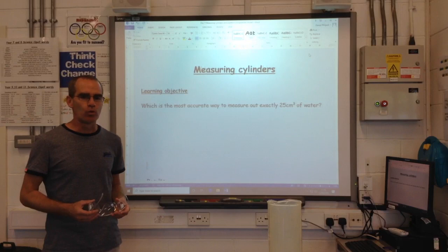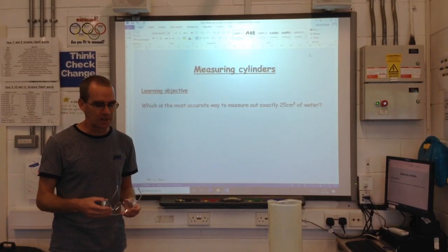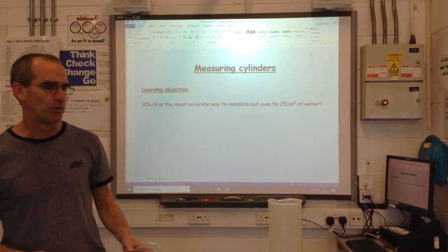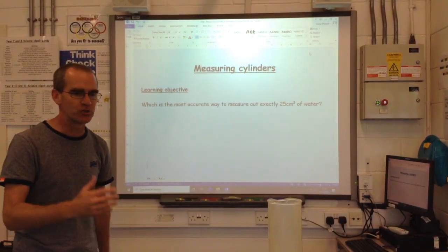Today we're only using water, and it's cold water. We don't have any glassware apart from one beaker, so normally we would wear goggles, but I'm not going to wear goggles today simply because it's really important that I can see accurately the readings on the measuring cylinders.